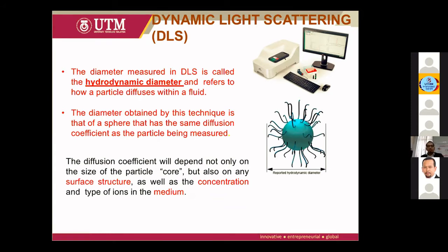What is it? Basically, when we talk about the hydrodynamic diameter, if you have any particle, we are not only measuring the particle itself, but we are actually measuring what is on the surface of the particles. Let's say you have a core shell blended with polymer. We are not going to measure the core shell only, but the core shell as well as the polymer attached to it. So this is the hydrodynamic diameter.